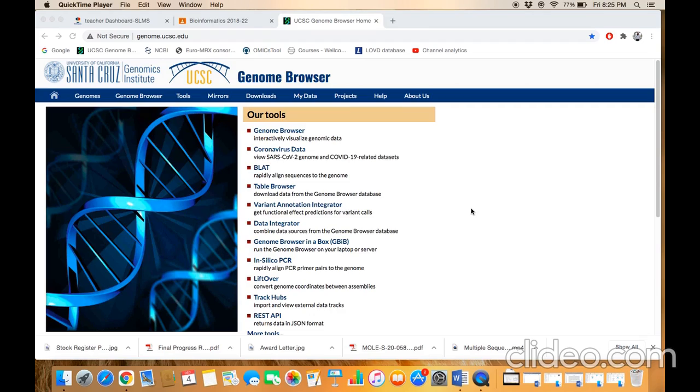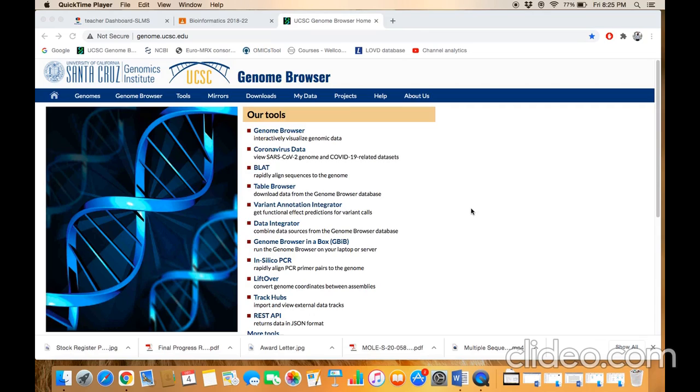BLAT is actually an improved version of BLAST, which is the Basic Local Alignment Search Tool. This BLAT tool is available in both UCSC Genome Browser and Ensembl Genome Browser, but for the purpose of this example, we will use this tool through the UCSC Genome Browser. This is the homepage of the UCSC Genome Browser.